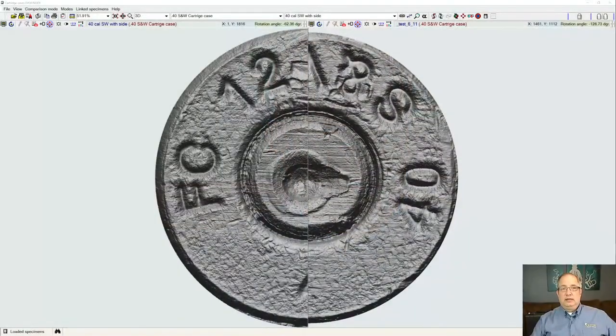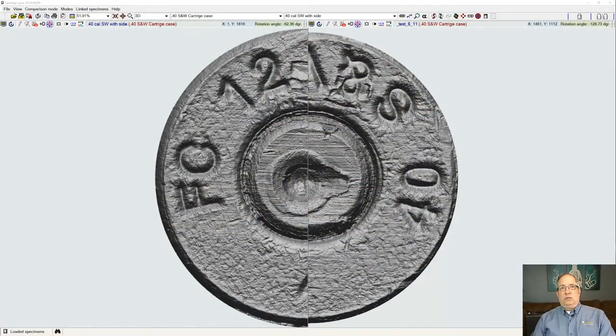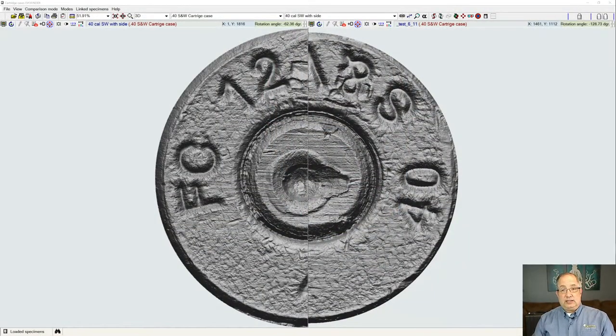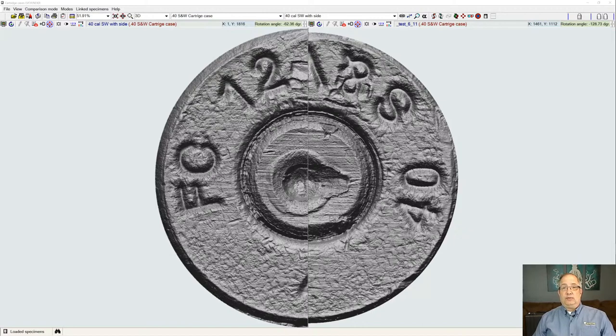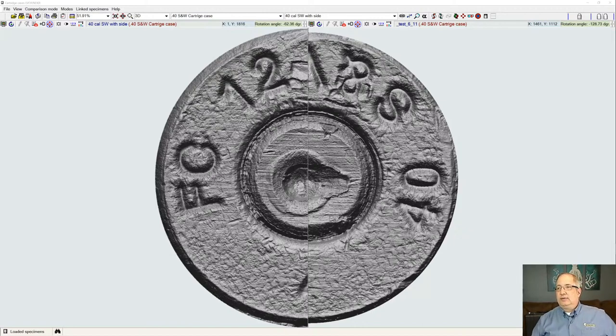If at any time you have questions during this, please type them in. We'll check at the end and we'll be able to answer the questions that you may have. Now getting into the first point, I'm going to go over to the EvoFinder software. We'll go over the sections of the EvoFinder software starting with the Ballistic Identification Scanning System itself.